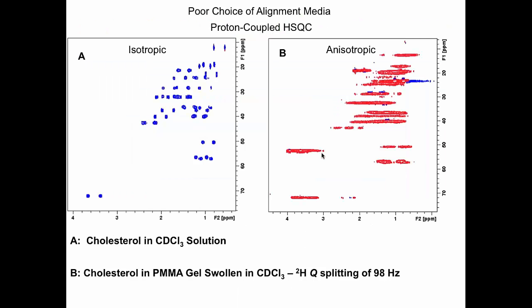Well, I was discussing this, and now we are going to go into practical terms. Most of my colleagues use F2 coupled HSQCs in order to measure the RDCs. Well, yeah, it is okay. There are HSQCs like the CLIP-HSQC that don't show distortions.